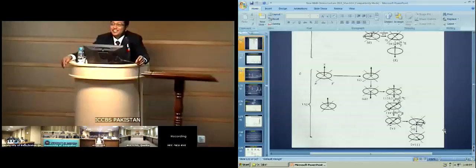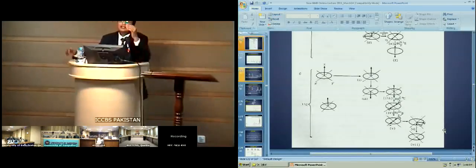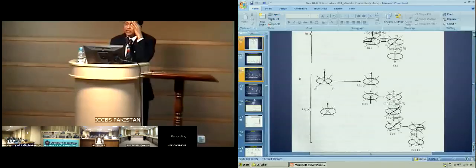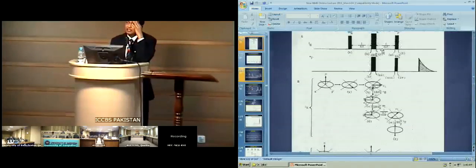The application of the proton pulse and the carbon pulse. Presumably it's done not simultaneously. You have to put it in line. So how do you follow? No, you can have a simultaneous pulse given to carbon and proton. For instance, this one is absolutely simultaneous.